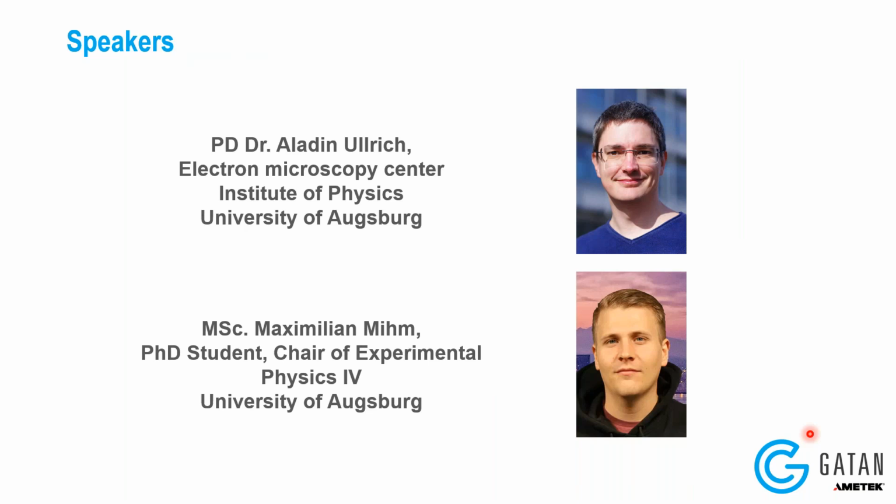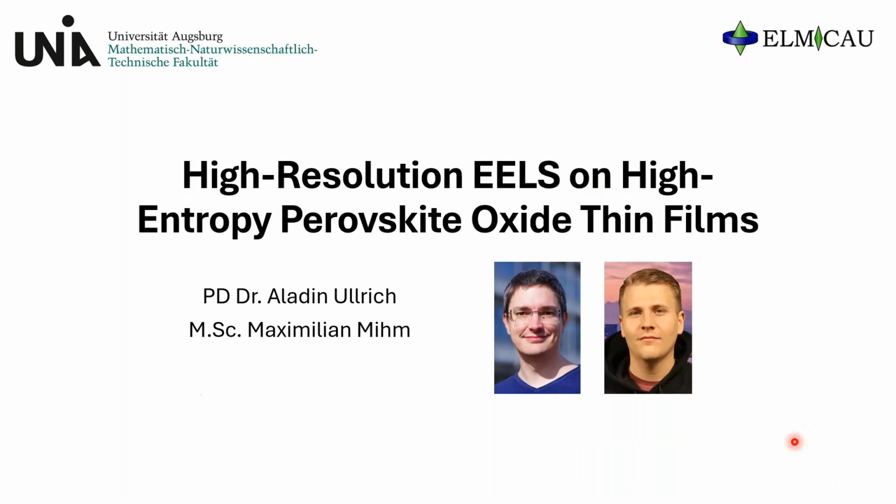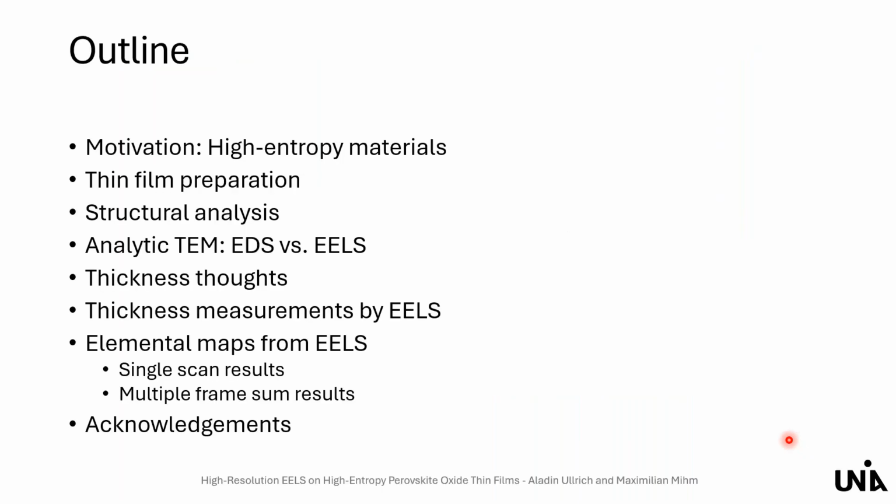Thank you for the kind introduction, and welcome everybody also from my side. Today, Aladdin and I will talk about high-resolution EELS and high-entropy perovskite thin films. The outline for today is the following. We start with a motivation: why are high-entropy materials of interest? And then we come to the thin film preparation and also the structure analysis. This is covered by me.